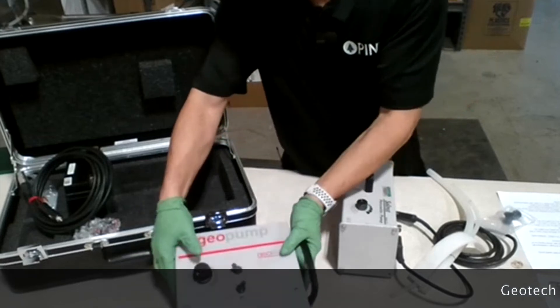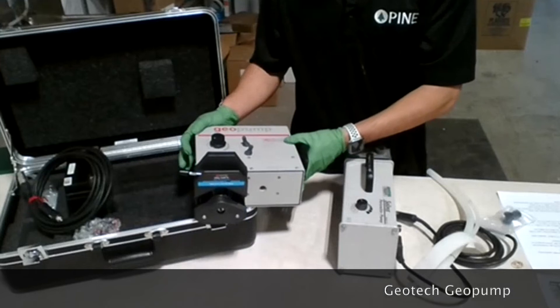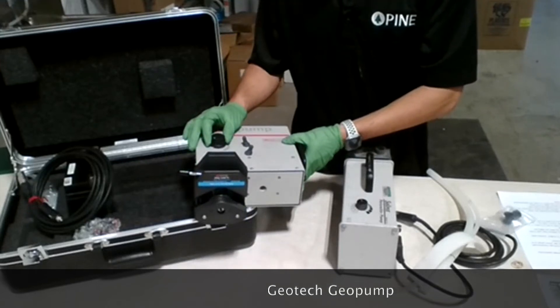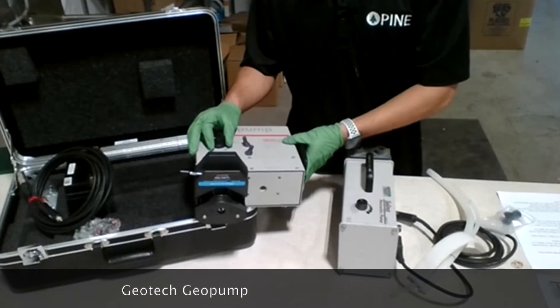The Geotech Geopump - for those who don't know, the peristaltic pump is a variable speed pump that's primarily used for low flow sampling.